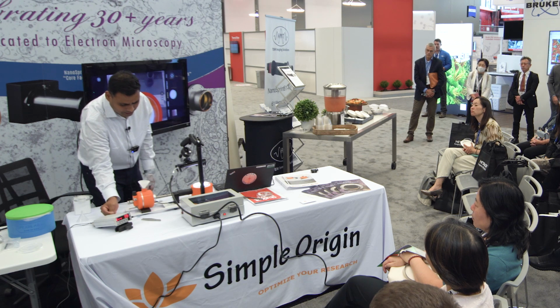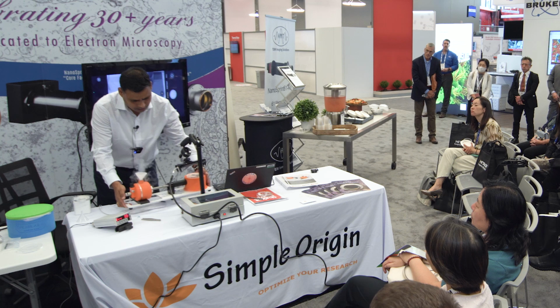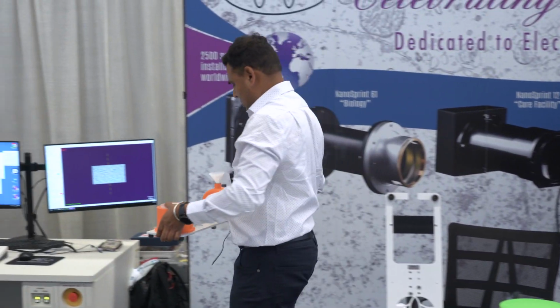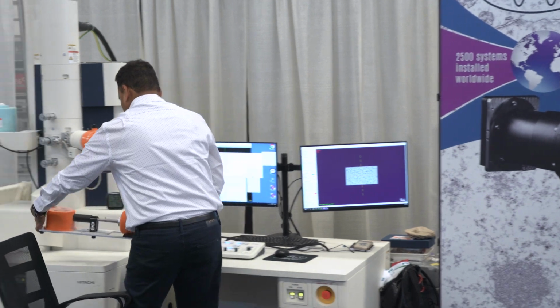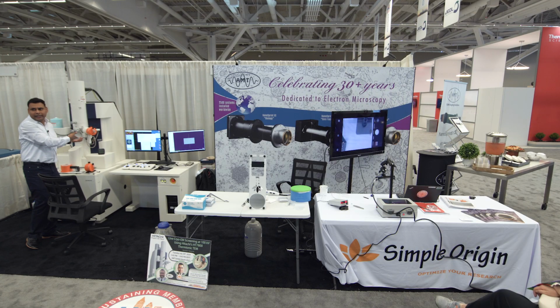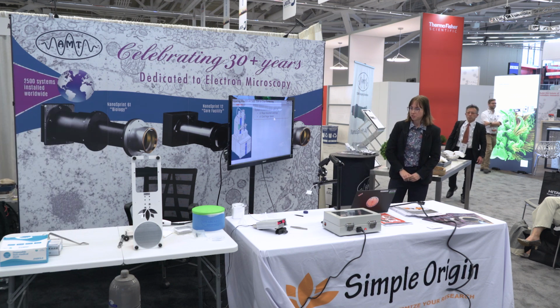The next step would be you take your workstation next to the TEM. At this point, you'll remove it and put it in the TEM. Thank you, Pushkraj, for the great transfer.